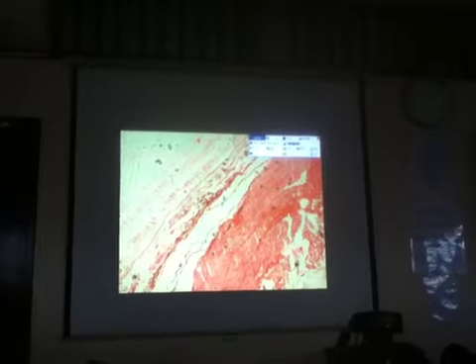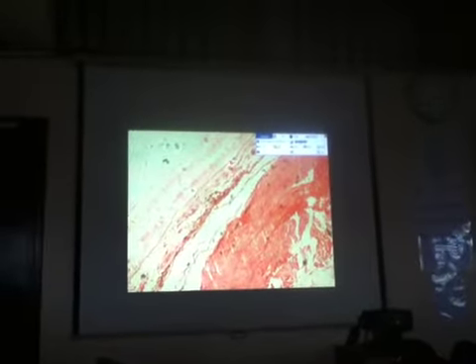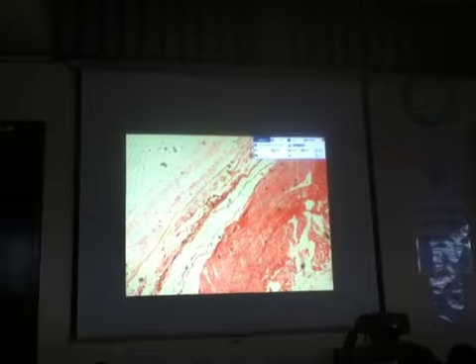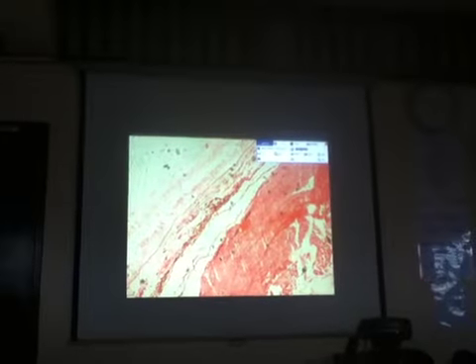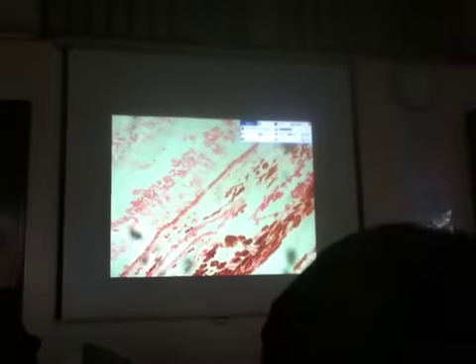The uvea. And then what will separate the uvea from the retina is that line, which is actually composed of simple columnar epithelium. Because the epithelium is colored with melanin pigment, what is the specific name of that epithelium? Okay, because it is colored with melanin pigment, it is called RPE, the retinal pigmented epithelium, separating the retina from the outer uvea.